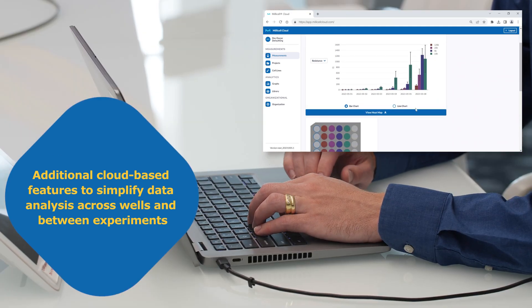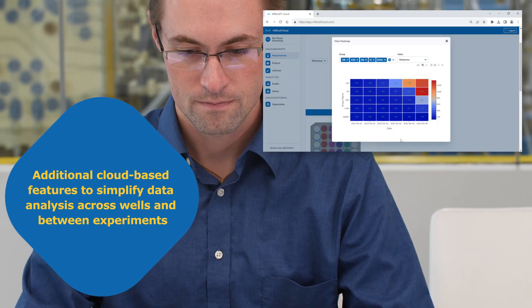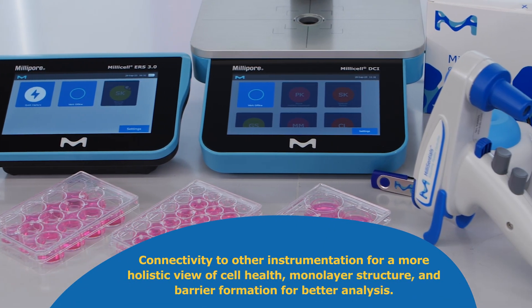Expand your lab capability, save cost, and ensure redundancy with data backup and protection. Optimize your cell culture workflow with connected lab instrumentation.